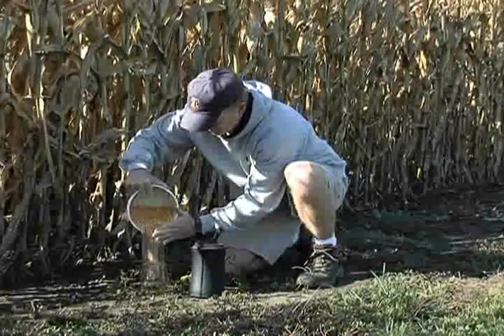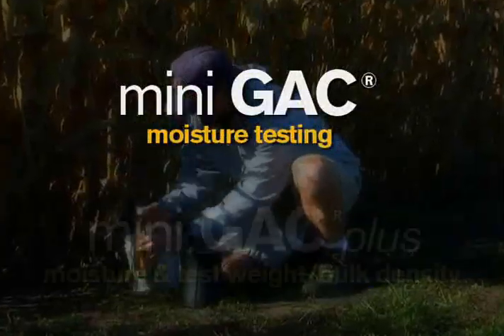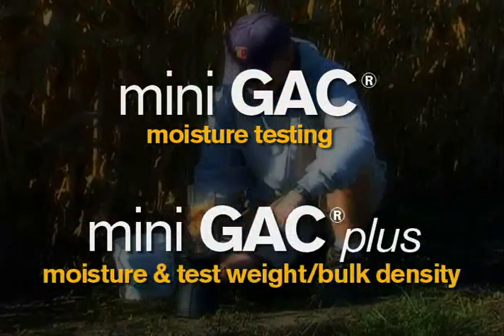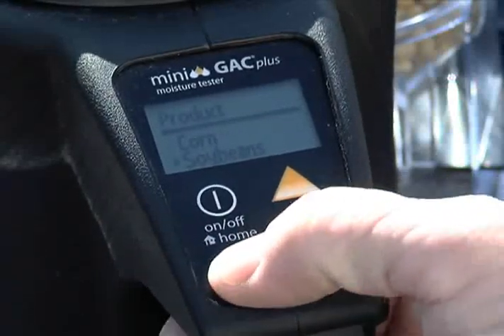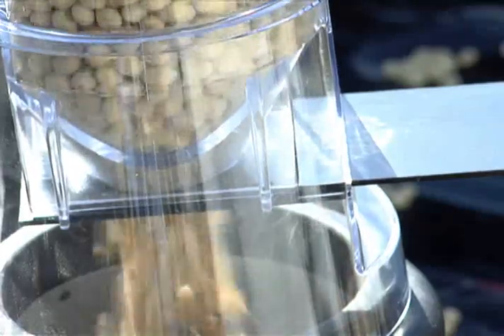Get precision results with two models to choose from. The Minigak offers moisture testing, while the Minigak Plus calculates moisture and test weight bulk density. Its menu-driven operating system lets users quickly choose a grain with the push of a button. Plus, there's no pre-weighing needed, and you can test grain hot or cold.